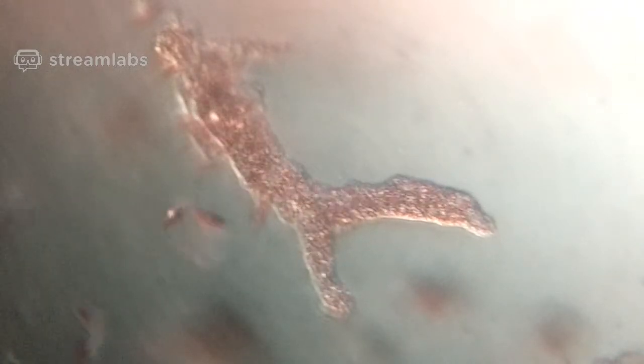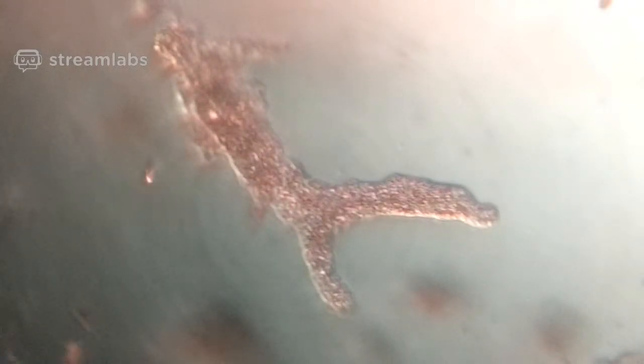Now, what did I do? How did I get this special effect? It's very trivial. So what you do is, here's your Foldscope, right? There's no light module here. And now what I have is gel paper.